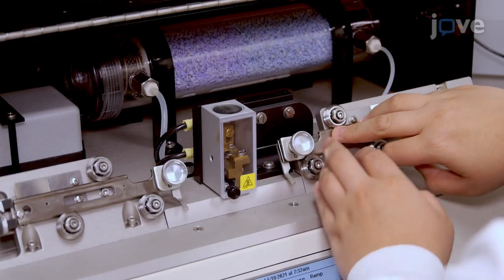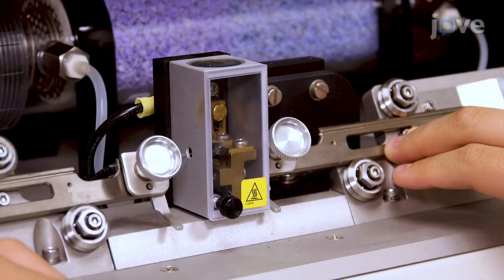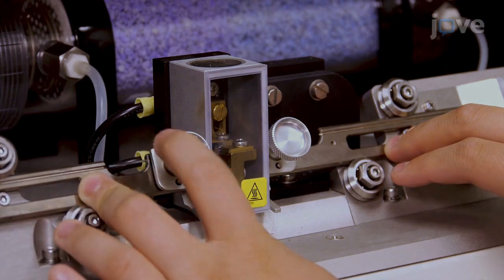To generate needles for the microinjections, place an aluminosilicate capillary glass into a needle puller, following the manufacturer's instructions.